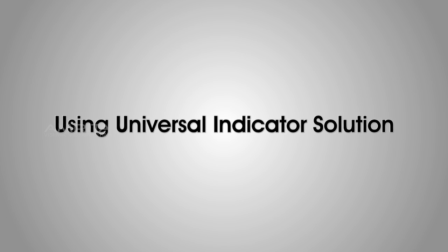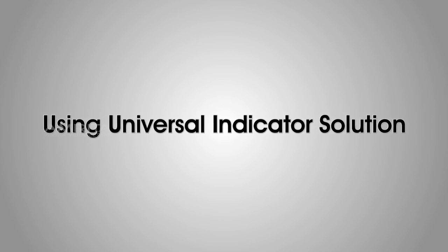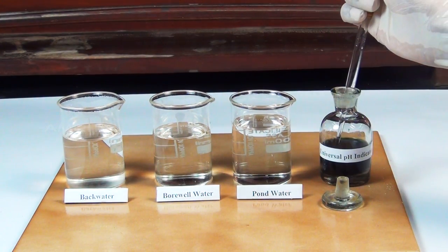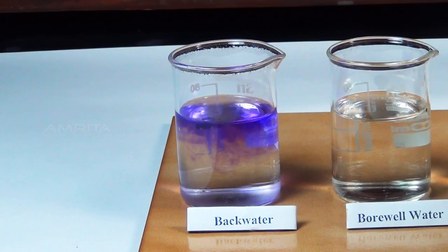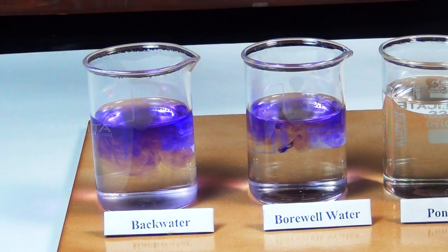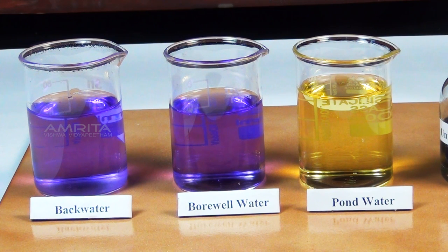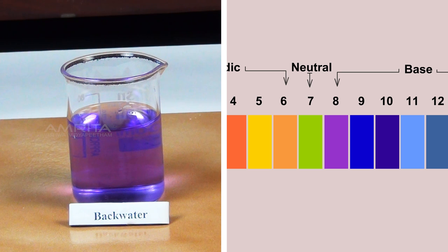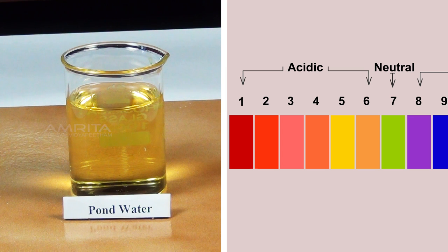Let's check the pH of the water sample using universal indicator solution. Using a dropper, take some universal indicator solution. Put 5 drops of indicator solution into the beaker that contains the water sample. Note the color developed and compare it with the color chart. We can observe that back water and borewell water has pH 8 and pond water has pH 5.